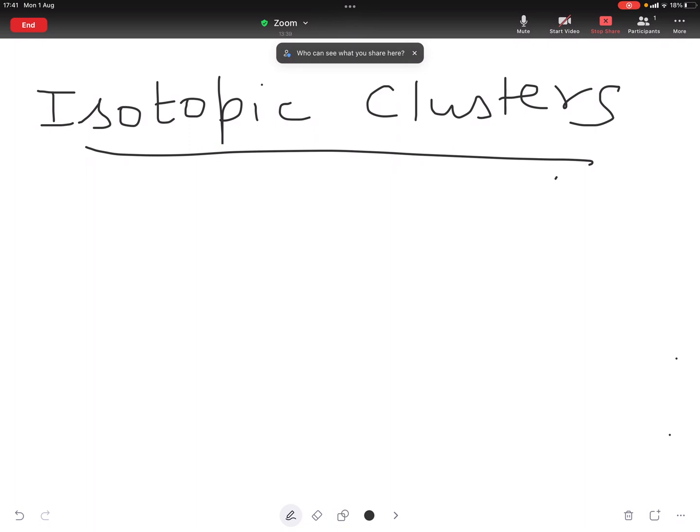Many elements occur naturally as a mixture of isotopes. Isotopes of lighter mass predominate, this is to be remembered. Many elements occur naturally as a mixture of isotopes, resulting in the appearance of the second isotope, which is the heavier one, in the molecular ion region of the mass spectrum. Thus, the presence of an element such as chlorine, bromine or sulfur containing two or more isotopes of natural abundance leads to a characteristic pattern of peaks, which is called isotopic clusters.